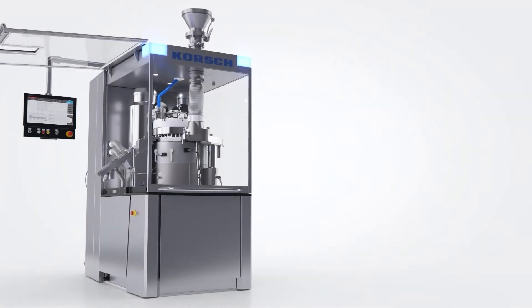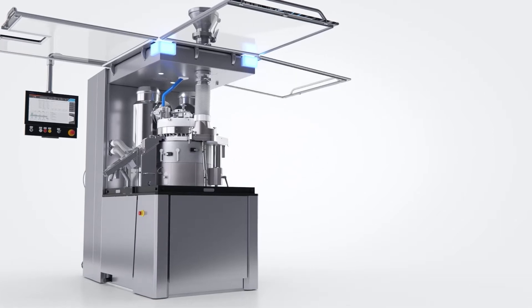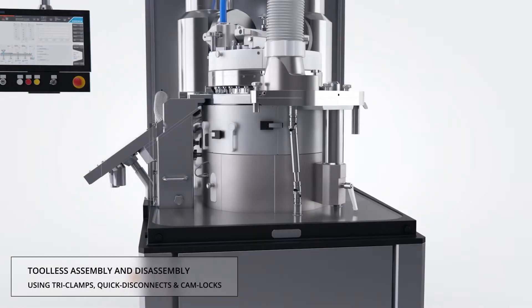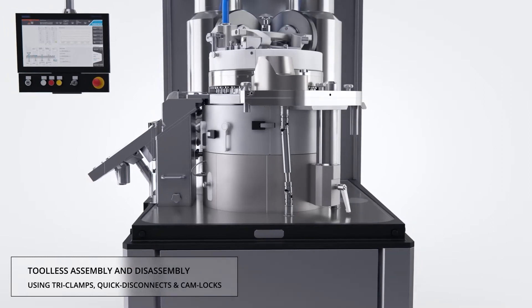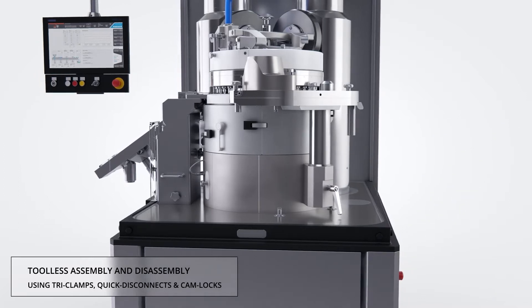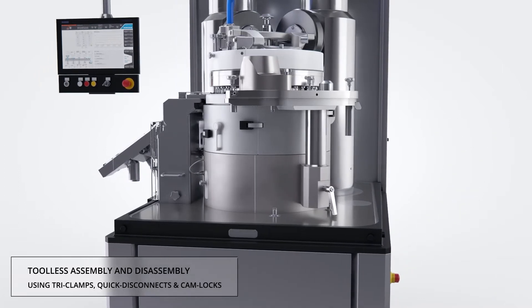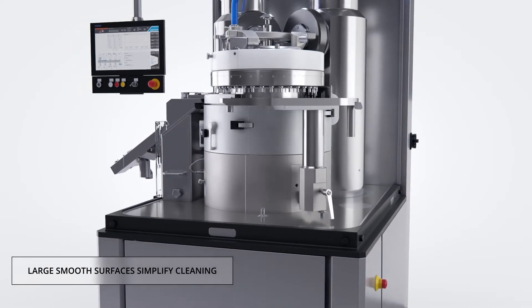Our design eliminates the use of corner columns, resulting in unlimited access to the press zone. Due to the streamlined design of the compression zone, only a limited number of quick disconnect components need to be removed to go from full production to turret removal. The disassembly process requires no hand tools and all components are removed effortlessly.